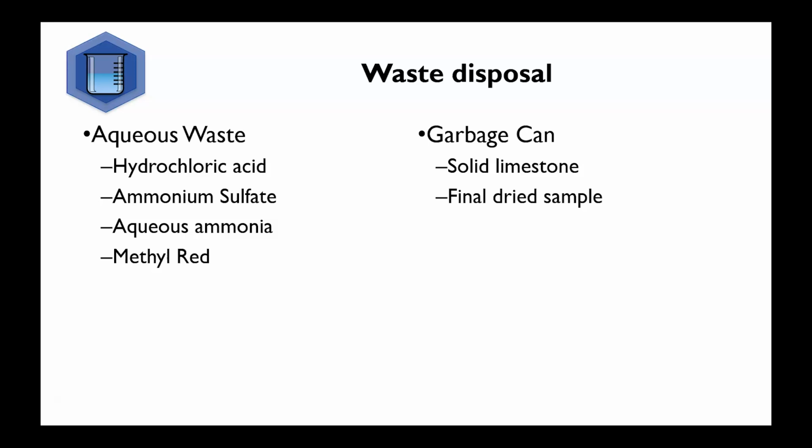For this lab, make sure that you put waste in the appropriate container. Any extra hydrochloric acid, aqueous ammonia, ammonium sulfate, and methyl red go into the waste container. Please keep in mind that these should be very small quantities, as you want to take close to the amount that you need. Any solid waste, like leftover limestone or other solids, can go in the trash can.